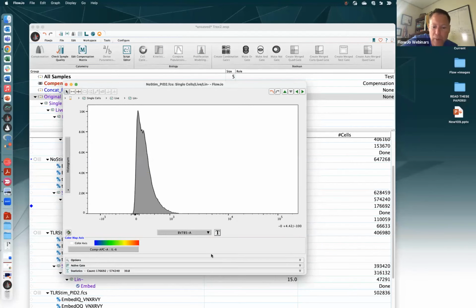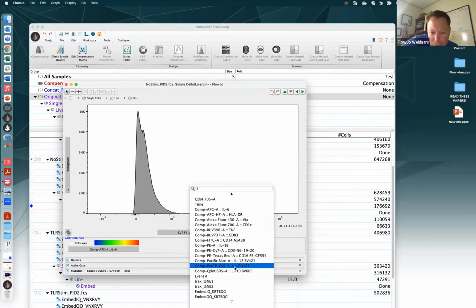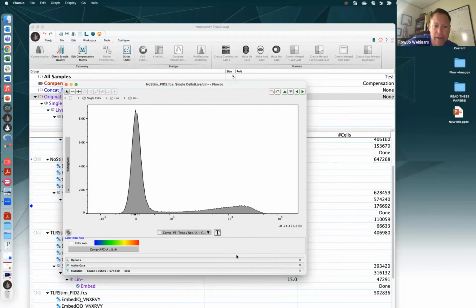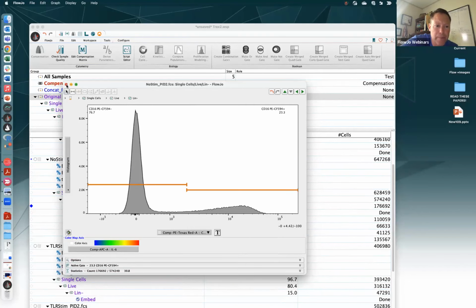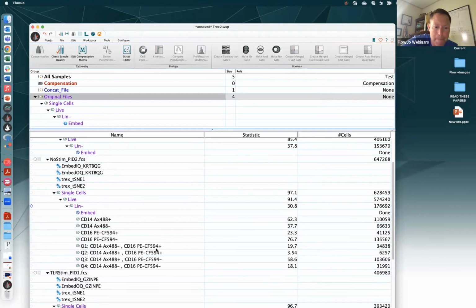And then I'll pick a different parameter. Hunt around for something else bimodal. Yeah, cool. Some other kind of bifurcator gate. Highlight those bad boys. And let's make a curly quad. Okay.